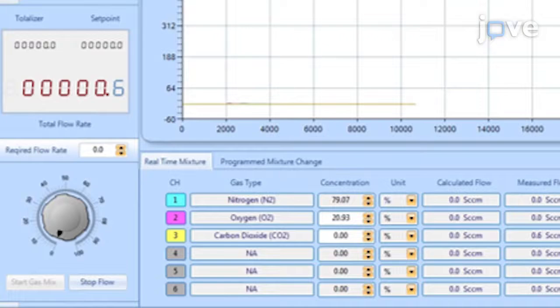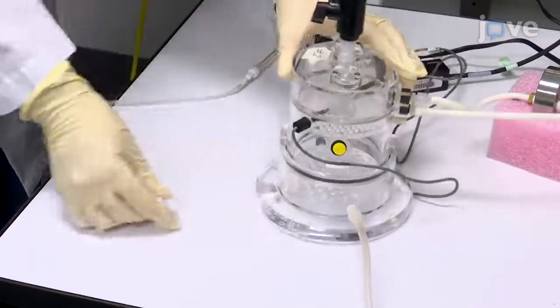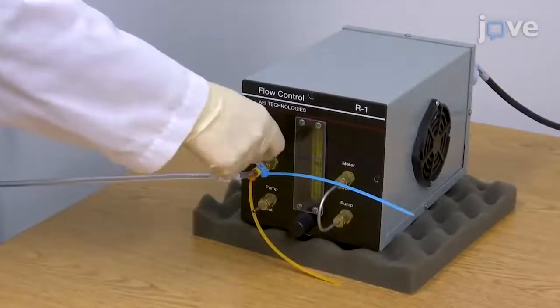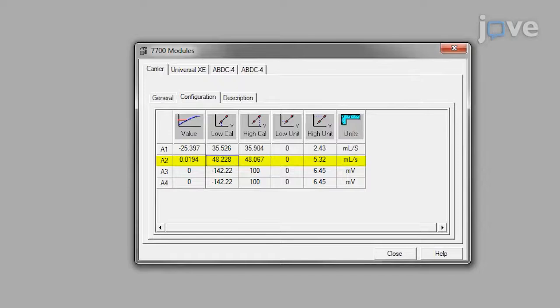To calibrate the low flow into the chamber, set the flow into and out of the chamber to zero and remove the flow tube into the chamber. Turn off the vacuum and enter a zero into the low unit cell to record the zero flow in the 7700 amplifier setup of the barometric plethysmography software.